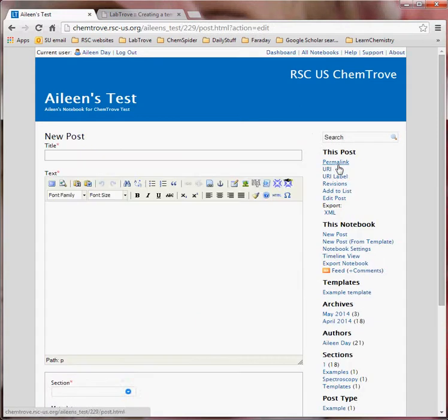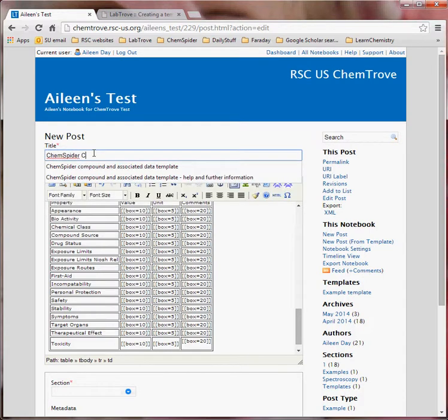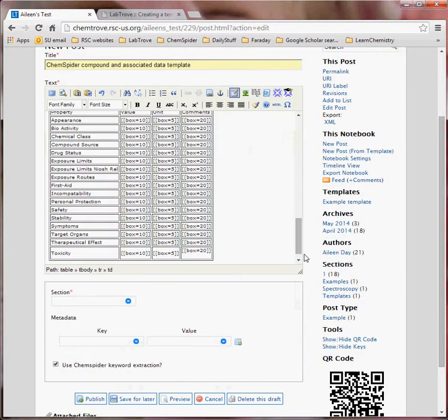make a new post, make sure that you put in the same title as the one that we have, just for consistency.